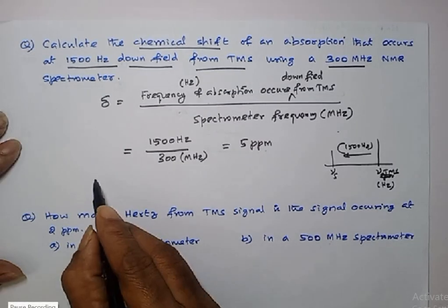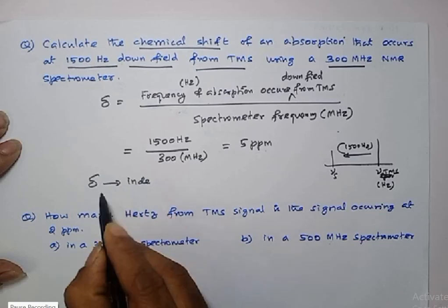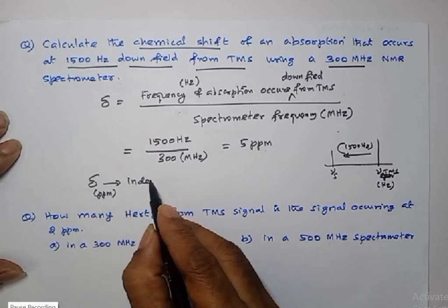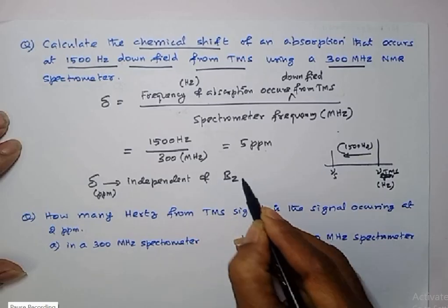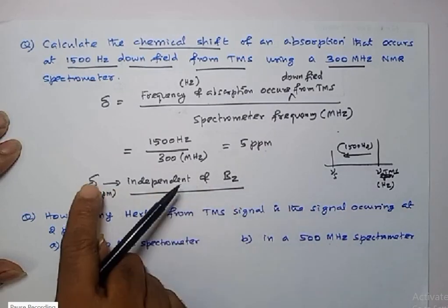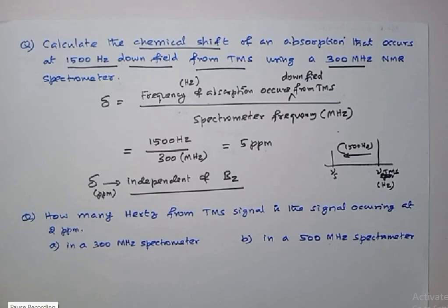I have already told you, chemical shift in ppm is independent of the external magnetic field strength Bz. If we change the external magnetic field, the chemical shift does not change. Keep this in mind.